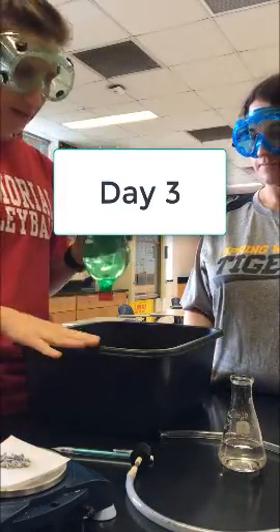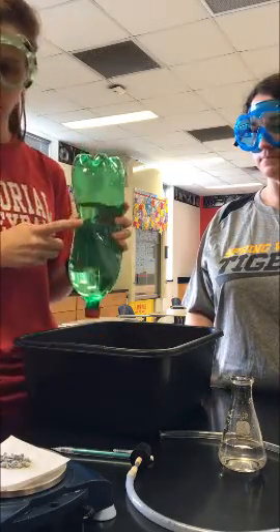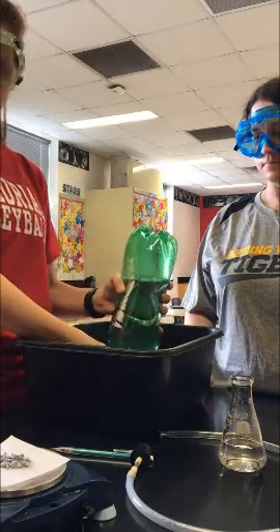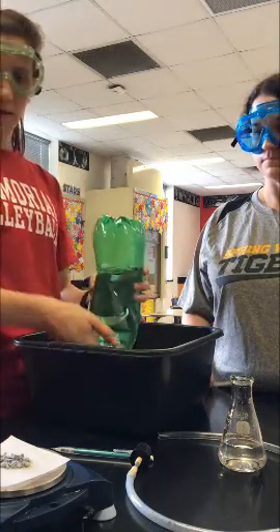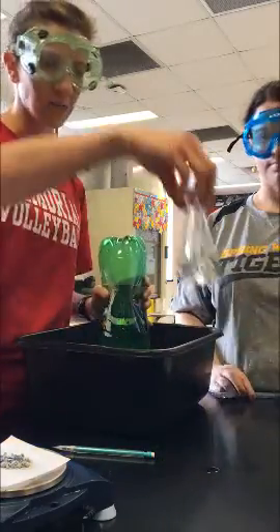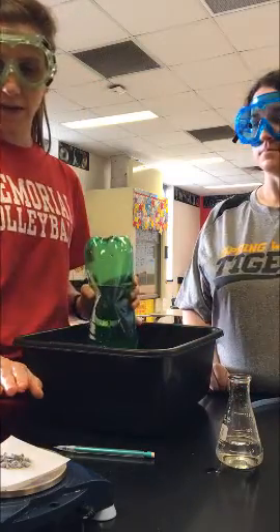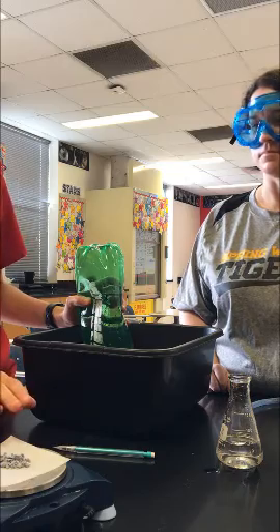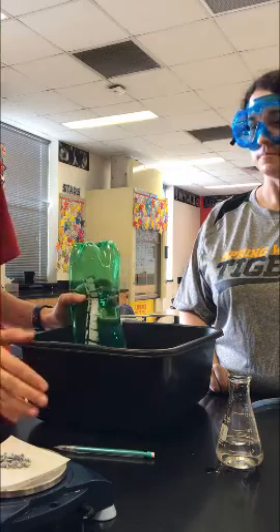Day three: fill the bucket back up halfway with water. Get your rocket from yesterday, place it into the water inverted with the mouth down, and leave the cap on until you're ready to fill it with hydrogen gas. To fill with hydrogen gas, take your Erlenmeyer flask — we've already filled it with 75 milliliters of tap water and measured out the appropriate amount of calcium calculated in step two of the pre-lab questions, plus an extra 0.3 grams.